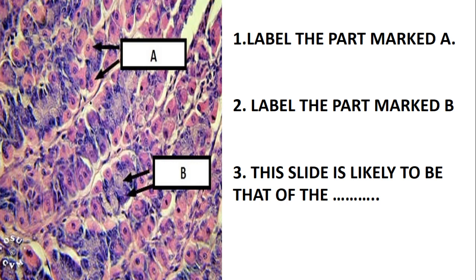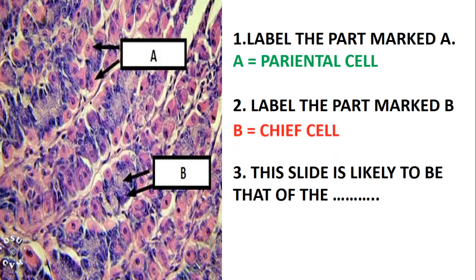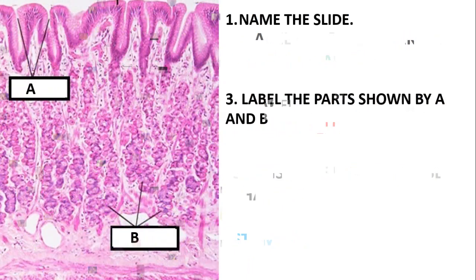Let's look at this next structure. Label the part marked A — these cells are just known as the parietal cells. Looking at this slide, it is likely to be taken from the stomach. Then label the part marked B — if A was the parietal cells, then B cells are just the chief cells. This slide is likely to be that of the stomach.